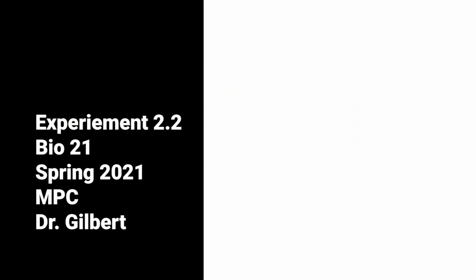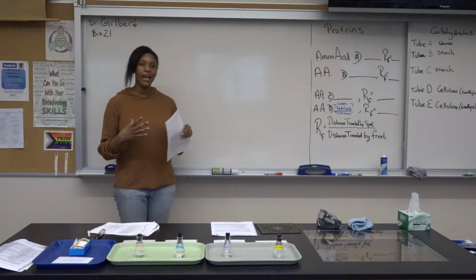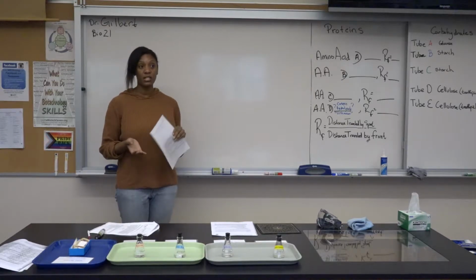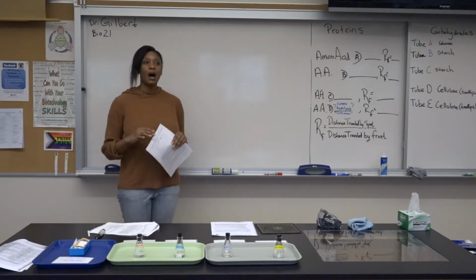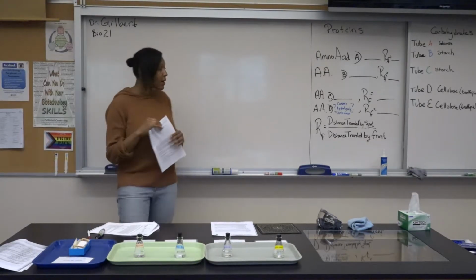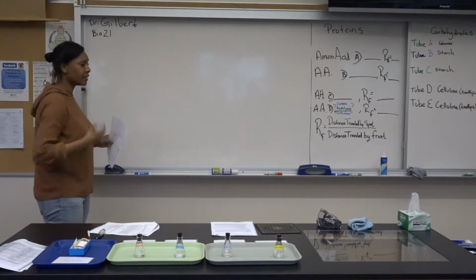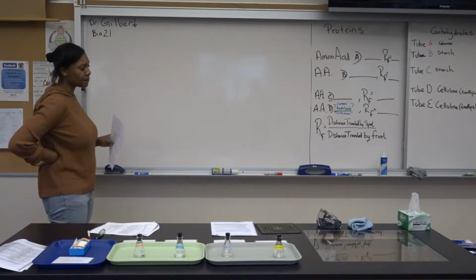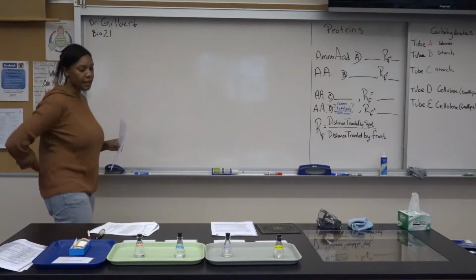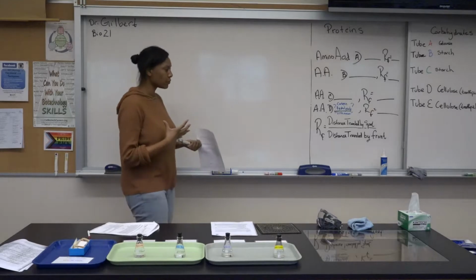So, welcome to our second experiment. In this experiment, we want to figure out a little bit more about what a compound has, or what a homogeneous solution has, more than it just having protein, right? Because as you know, there's 20 amino acids, and they all have big influence on the behavior of that protein once it's in its polymer form.